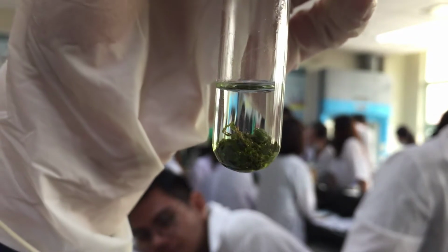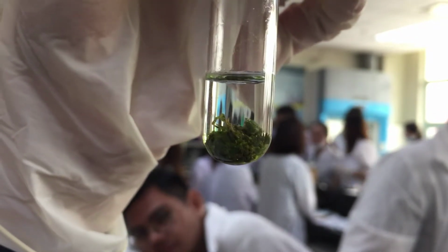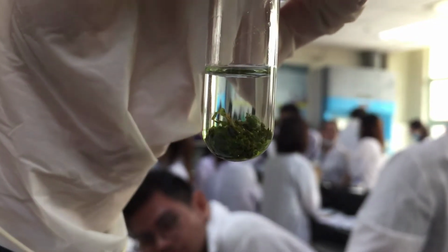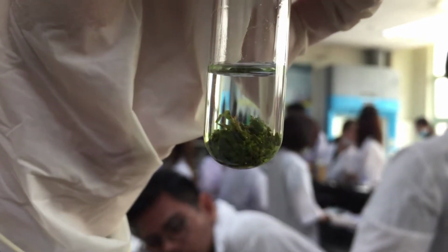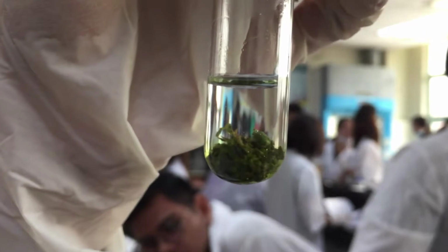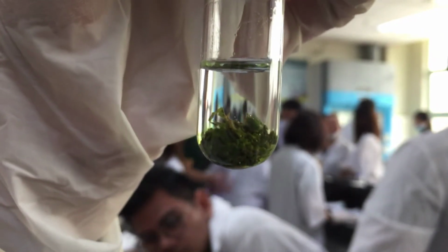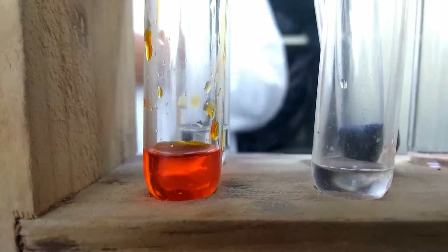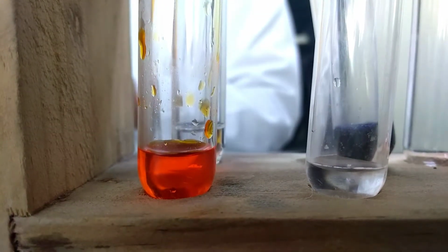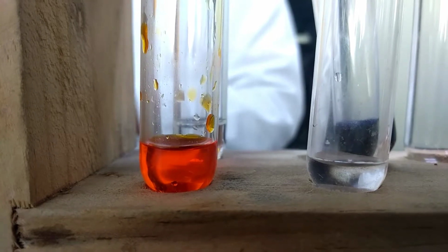For the grass or leaves pigment extraction, Step 1. Cut the leaves to small pieces, grind and strain. Step 2. Extract the pigments using ethyl alcohol as solvent. Concentrate the extract by allowing the alcohol to evaporate. Step 3. Using a capillary tube, make a spot on the Whatman paper strip. Make the spot prominent enough and dry.